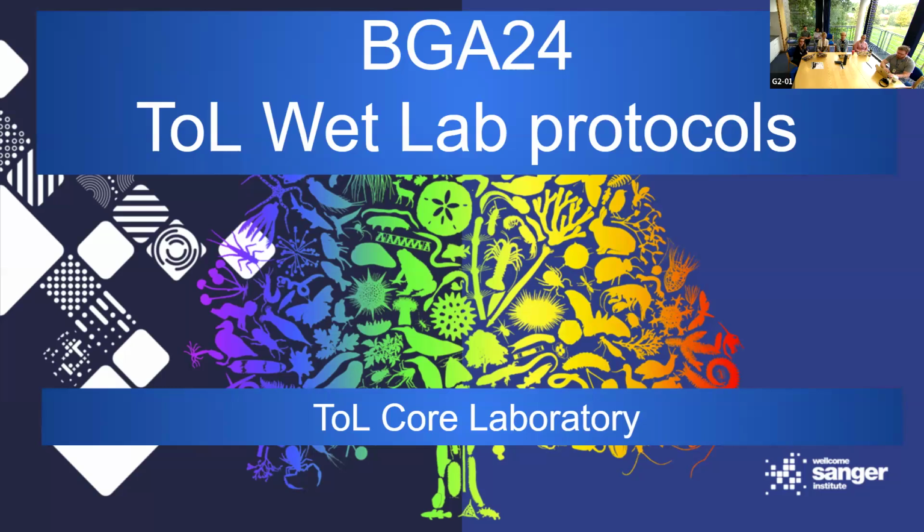So this is a presentation that encompasses some videos of our protocols, some experiences on decision-making for our DNA extractions and DNA fragmentation parts of our protocols. We'll go through the various protocols in video format. We have members of the team here with us, and we'll take turns to talk you through what we do in the lab to get some really good quality genomes out in the Tree of Life program.